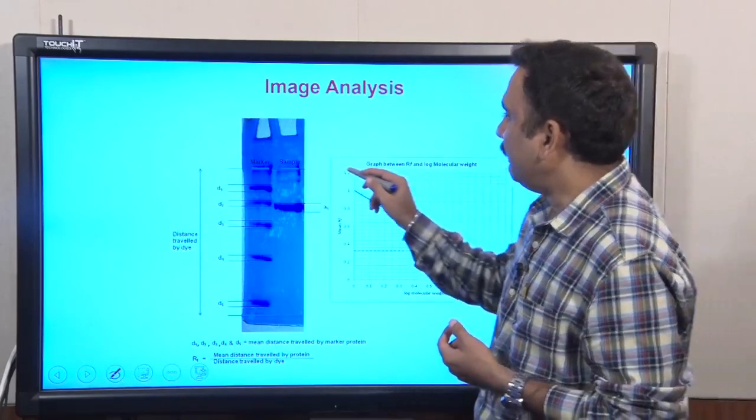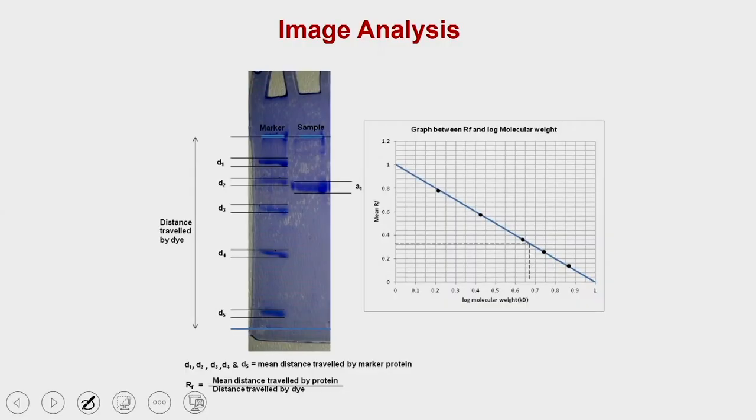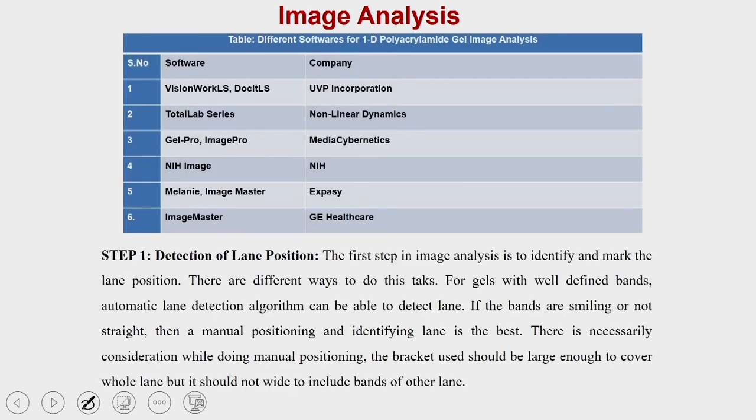You can see that if you have a gel image like this, what you have to see is the distance of this particular protein from the well, and the amount of the protein present. All this information you have to gather from the different lanes, and that's why people have developed different types of software to analyze this.